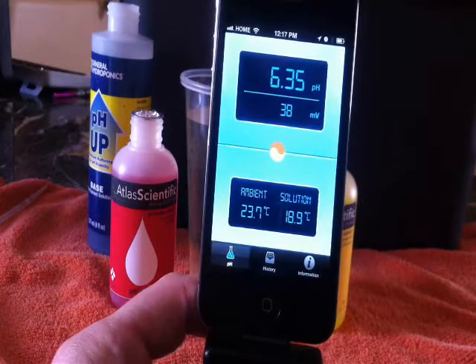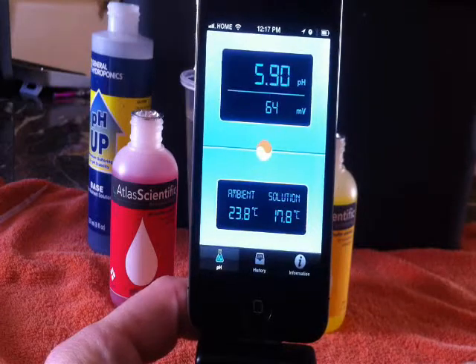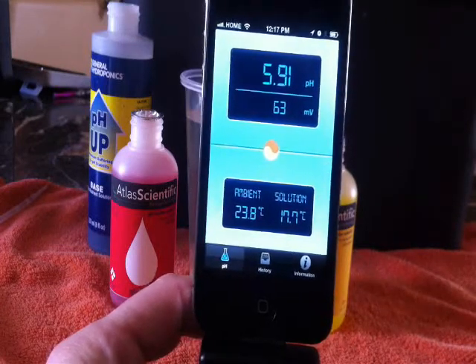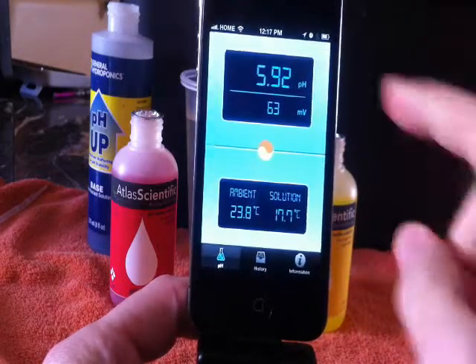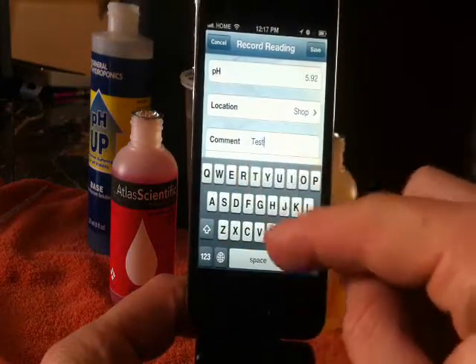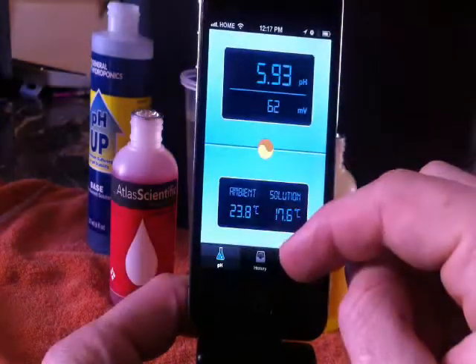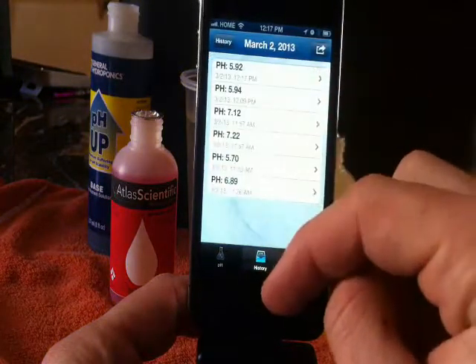As you're testing different solutions, you can save the data and email them straight from your phone. You can type in notes — so if you want to say this is coming out of this system, or I needed to add this, or the temperature was this — it will compile all this information so you can send it in a clean email very fast and very easy. I like that feature; that way I can keep track of what's going on from week to week with my system.